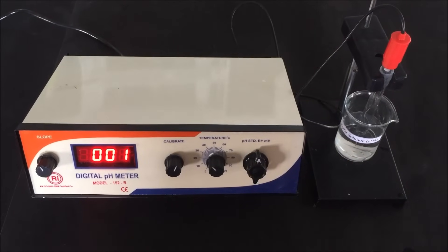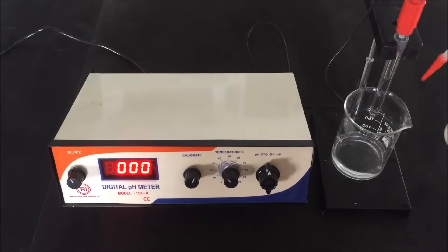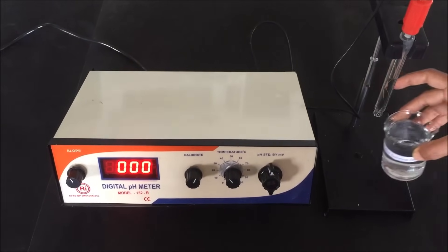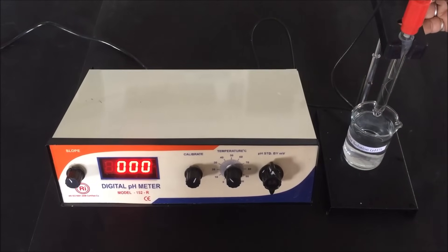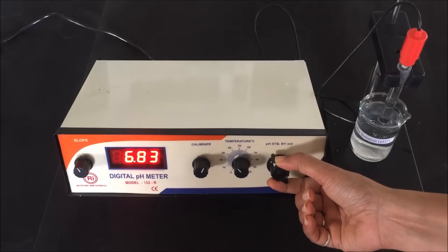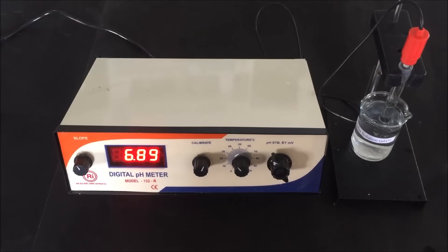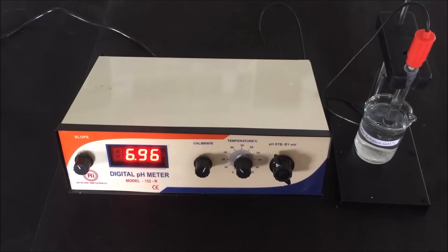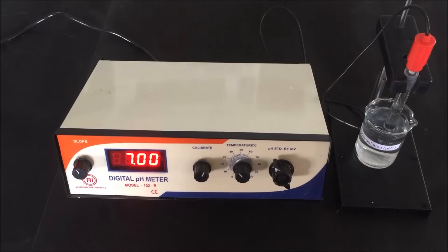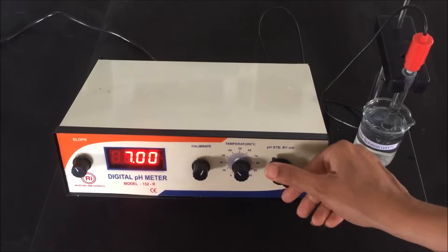Rotate the knob to standby mode and remove the pH electrode from the buffer solution. Rinse it with distilled water and gently dry it with tissue paper as done earlier. To confirm that the pH meter is calibrated, dip the electrode again into the pH 7 standard buffer solution and measure the pH without doing any adjustment. Rotate the function knob to pH mode and wait until the reading becomes constant — this section has been played at 4x fast forward. The display reading becomes constant at pH 7, confirming that our pH meter is calibrated.